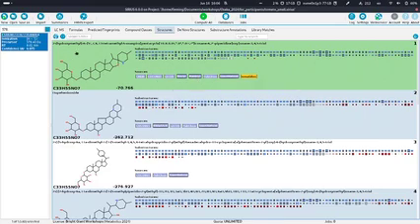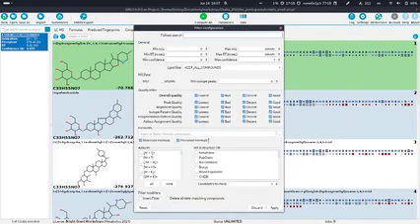Okay, and if you click on PubChem, you could see that one of the structures we get in PubChem also has the name tomatidine and then something else. So it seems to be some modification of tomatidine that we have found here, which is a very good hit. Okay, now that we have opened this custom structure database, we can also filter by this database.